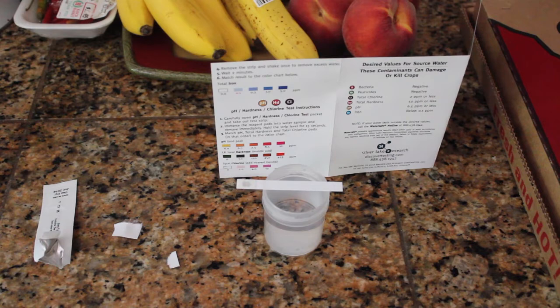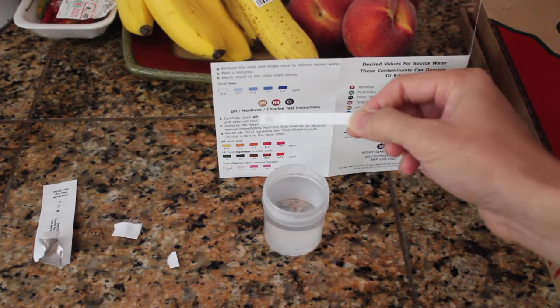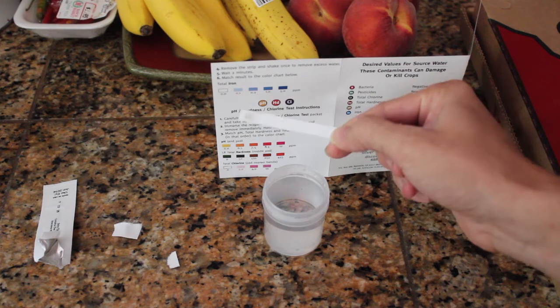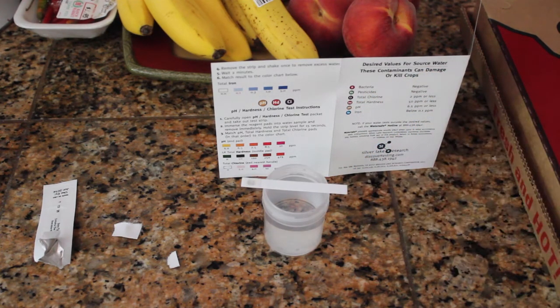It's been two minutes, just as the directions stated. Comparing this up to the chart, it would appear that according to this test I have zero ppm of iron in my water. No way for me to really tell independently whether that's true, but I'll have to trust the strip. I guess there's no iron in this water, which is always a good sign. Looks like it measures all the way up to five ppm. I use reverse osmosis water so I like everything to be at zero, but it's nice to hear I don't have a bunch of iron in my water.